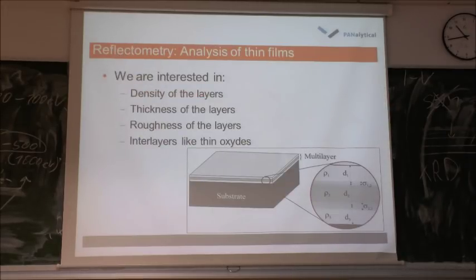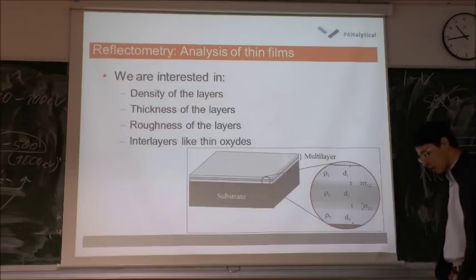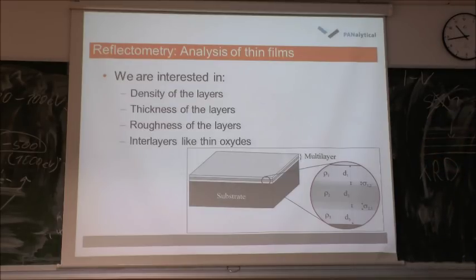Okay, then another application, which is also very important, is reflectometry. If you study interfaces, or if you study heterostructures, this is also very important. Why? Because you can get information about the density of the layers, their thickness, roughness, and some information about the interlayers. So actually, this is a reflection event, so it depends on the reflection coefficients of different layers as well as defects and densities. I mean, densities are actually related to reflectivity.